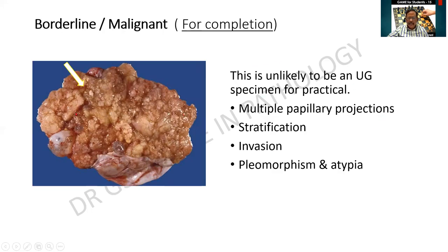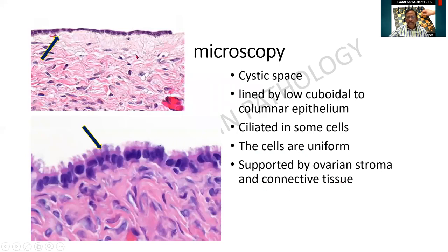This specimen is unlikely to be kept for the undergraduates, but it is shown for comparison. Multiple papillary projections, there will be stratification, invasion, pleomorphism, and atypia. These are the histological features. Microscopically, this slide can be kept for you.